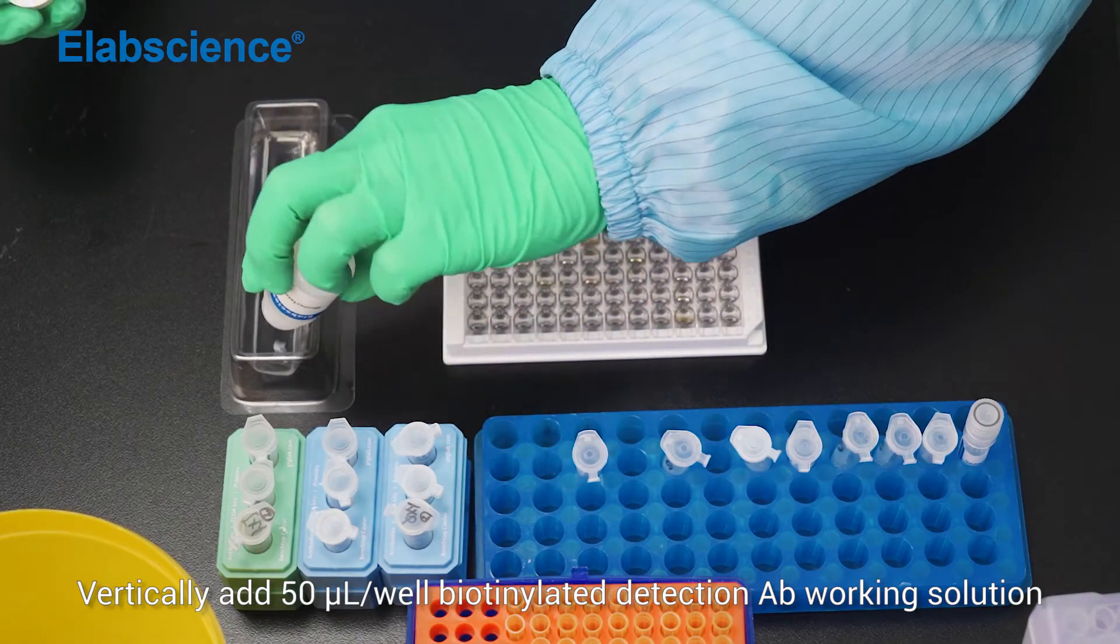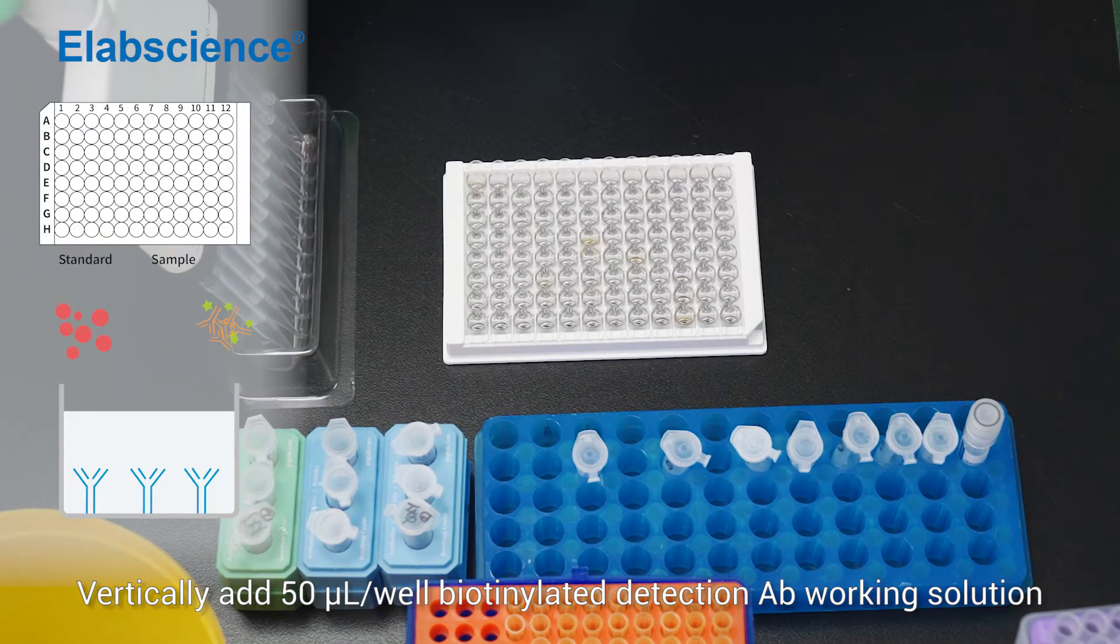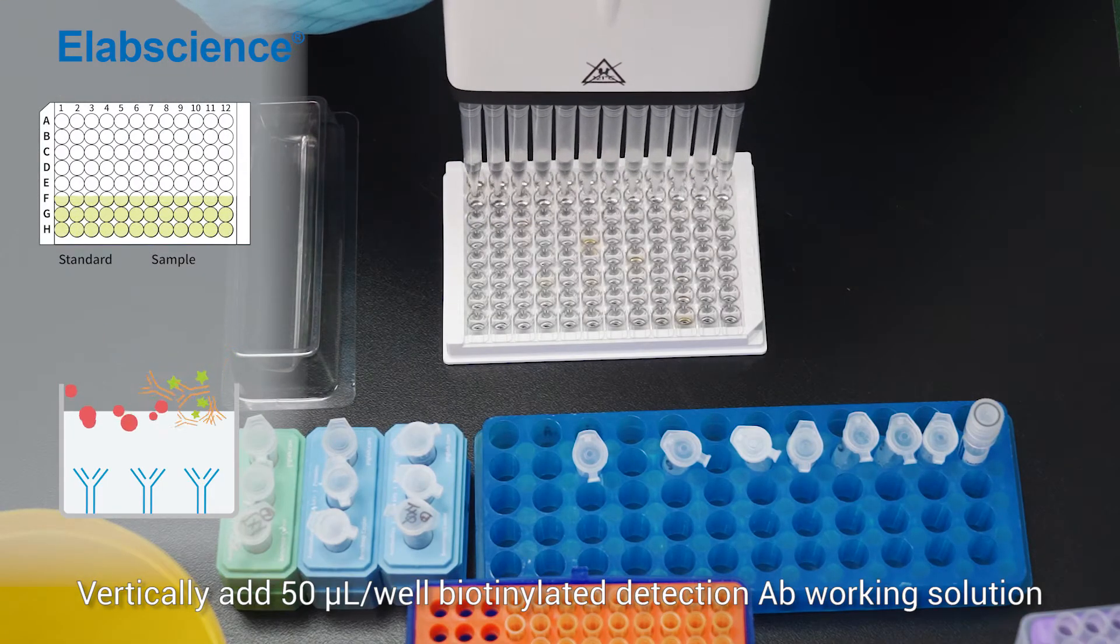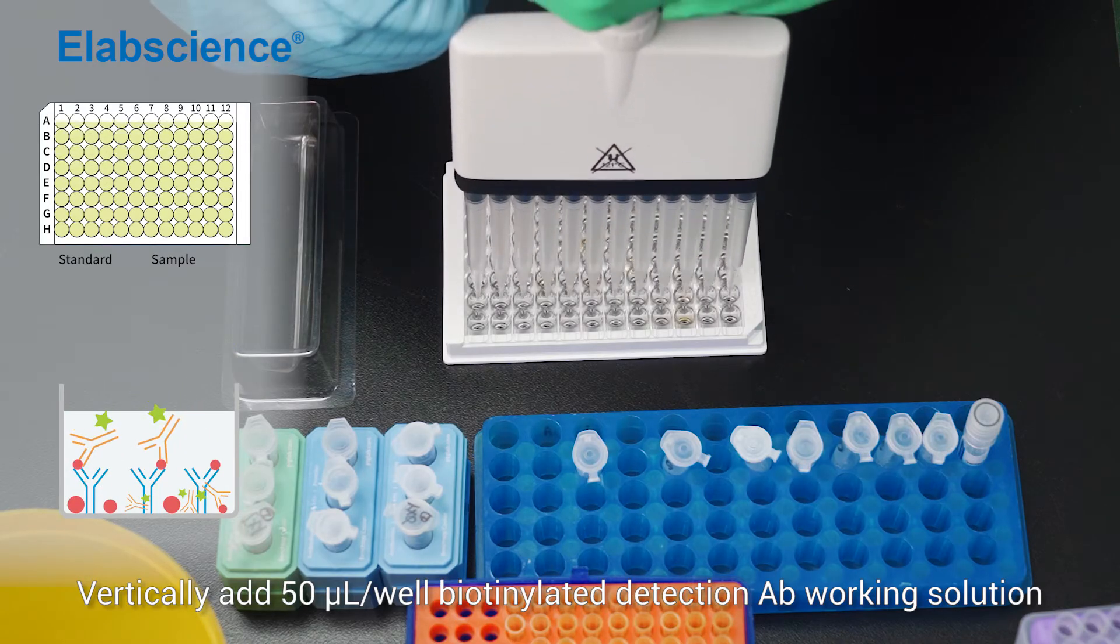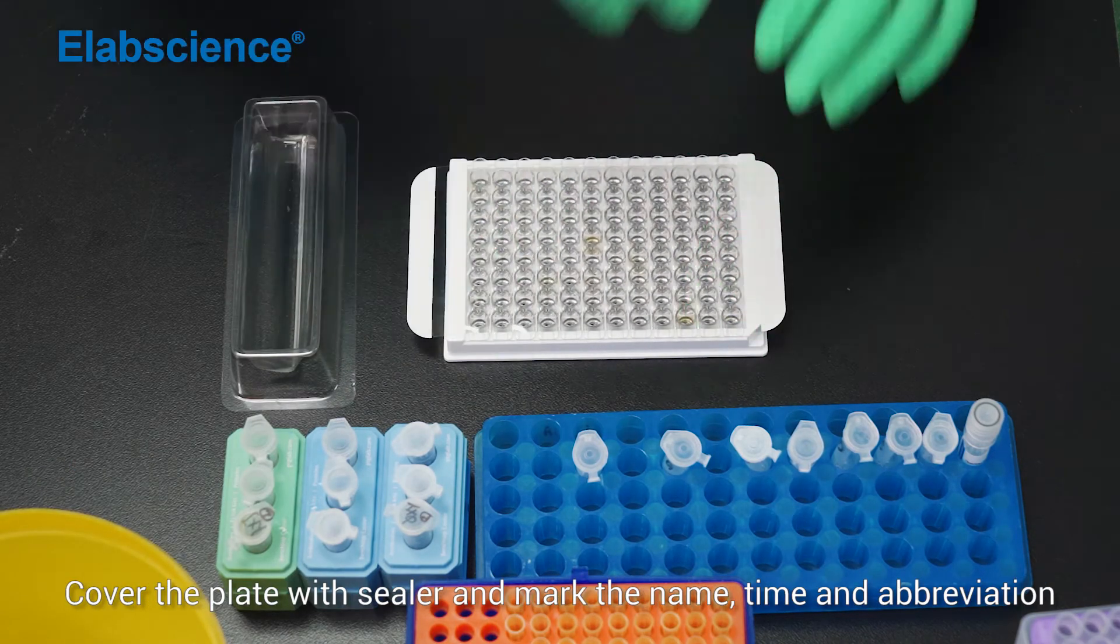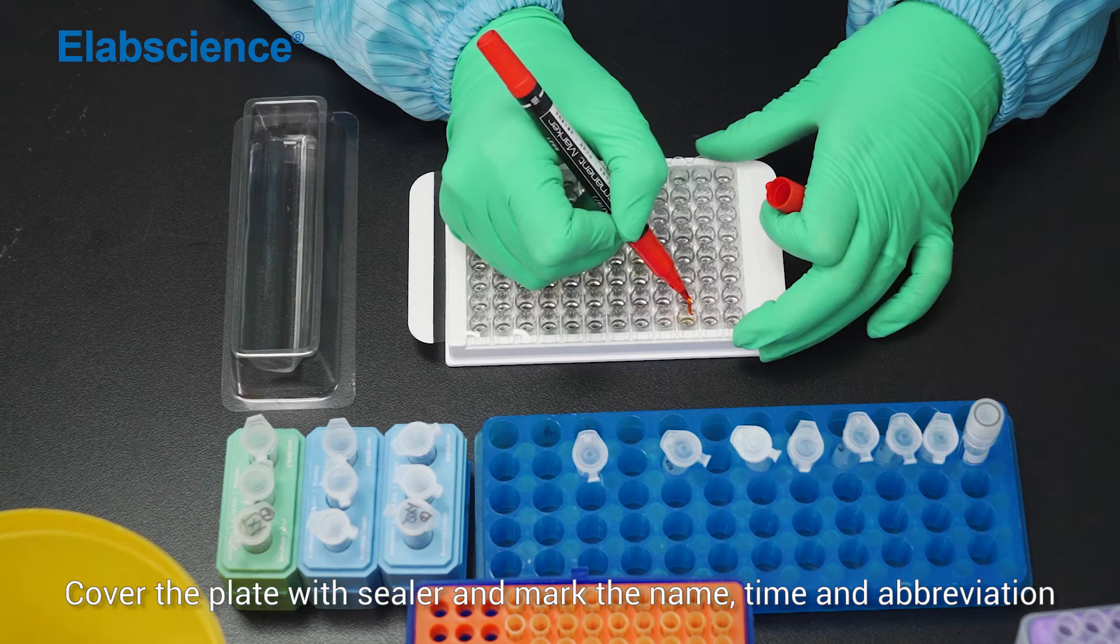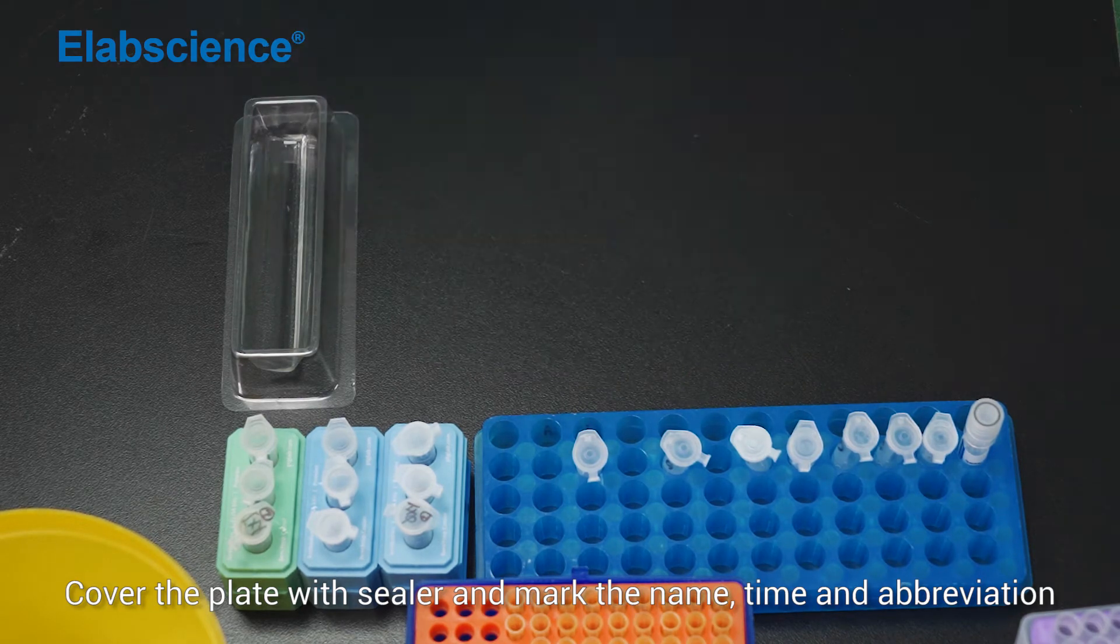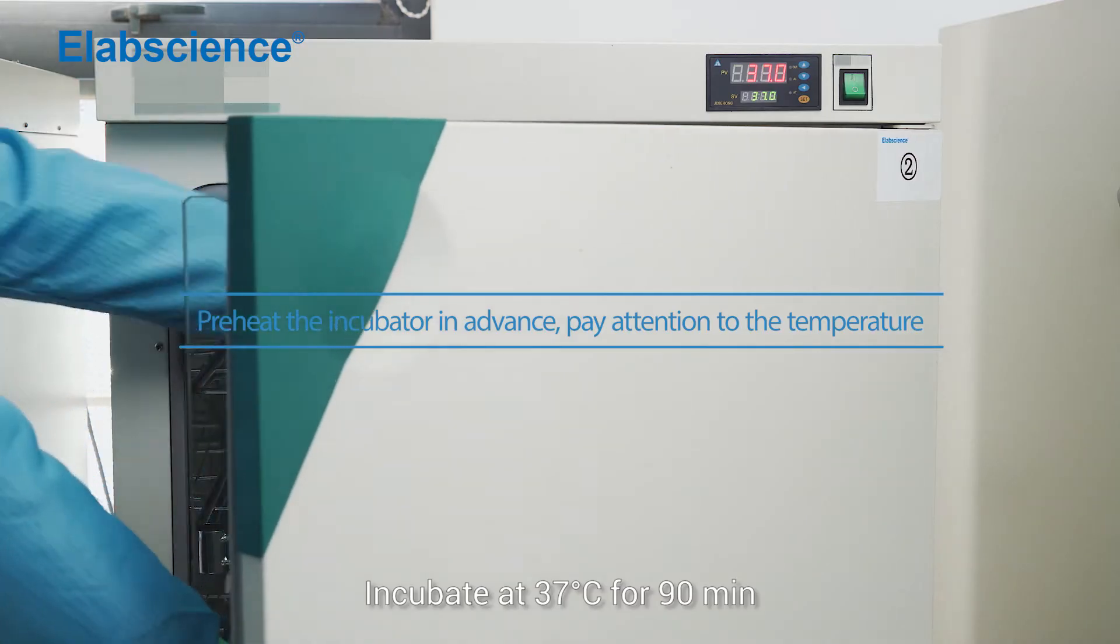Vertically add in 50 µL of biotinylated detection antibody working solution. Avoid touching the inside wall. Cover the plate with sealer and mark the name, time, and abbreviation. Incubate at 37 degrees for 90 minutes.